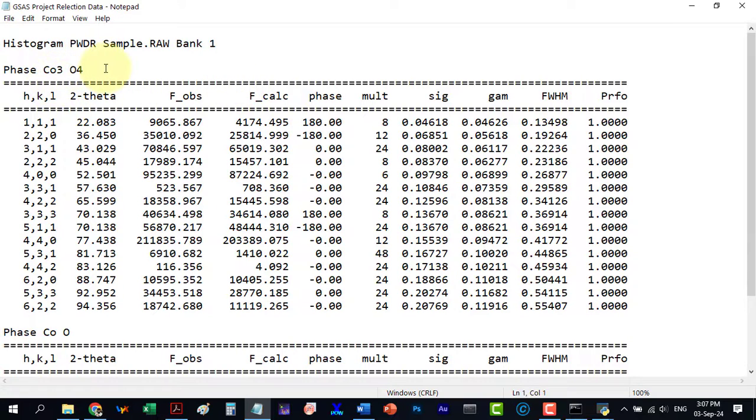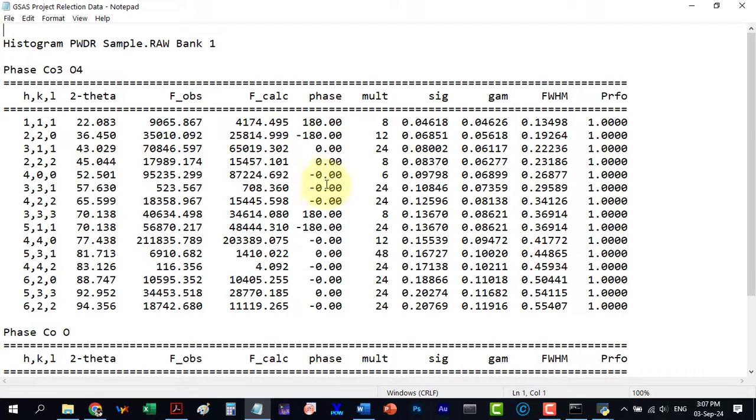From this we can extract the hkl, 2-theta and intensity values according to our needs.